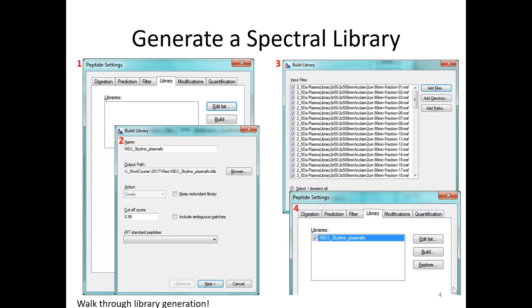When you do that, this window should pop up. And this name was something that I came up with, but I would try naming it that, and then you should be able to go into your flash drive and find that file. So that'll be like, 2 minutes later, the thing coming out of the oven that's fully baked, but didn't really take that long. That'll be the end product. Plasma FX. Yes, Plasma FX. The FX is for fractionated.